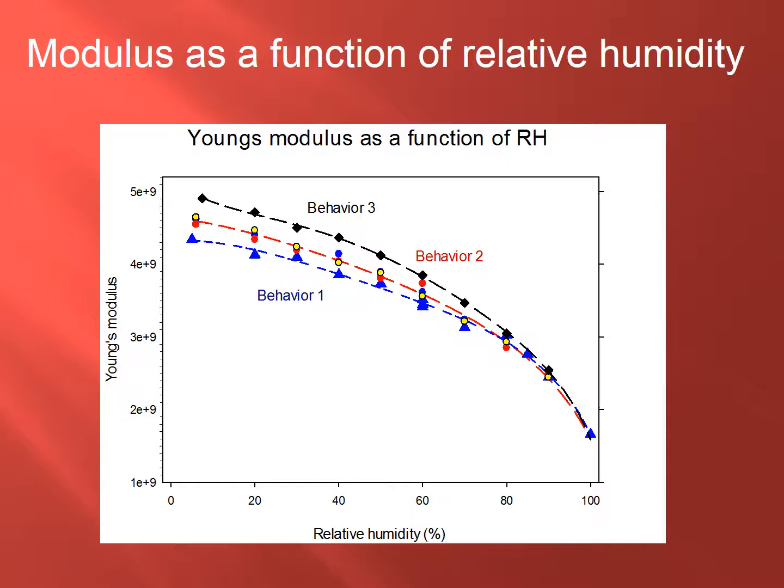And I think these small differences materialize due to the very rigorous and albeit rather time-consuming nature of the experiments that we've been performing, which, as we've mentioned, give rise to lower variability than we've traditionally seen, and we've also talked about the benefits of trends rather than just looking at single data points. It also seems that these differences have become better differentiated when testing is performed under low humidity conditions, which is something I suspect is rarely done and could be a reason why perhaps these observations have not previously been seen. And of course, our industry's traditional use of blended hair in much of the testing we perform may also have contributed to masking this observation. And again, differences in the mechanical properties appear to imply differences in internal structure, which, if true, could really be a major paradigm shift in our industry.